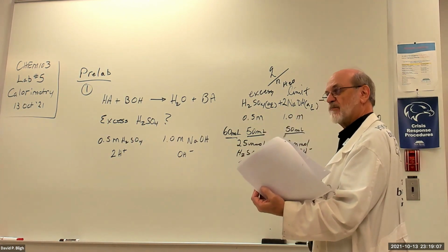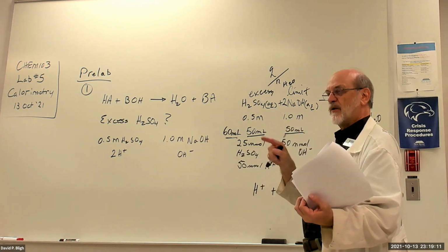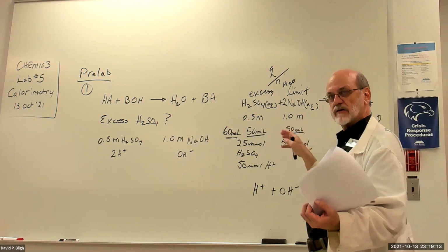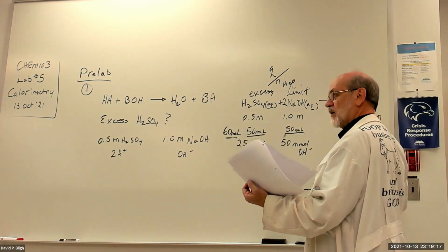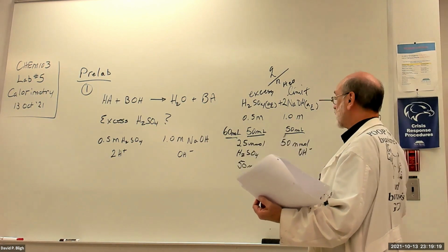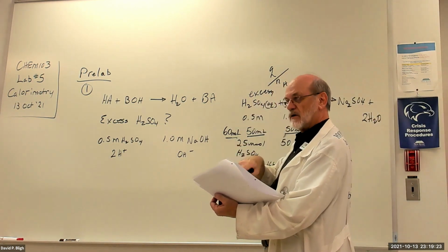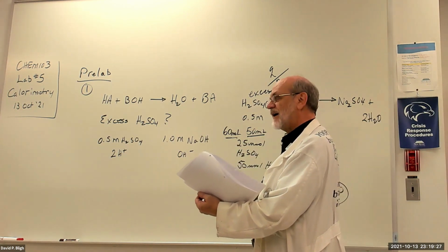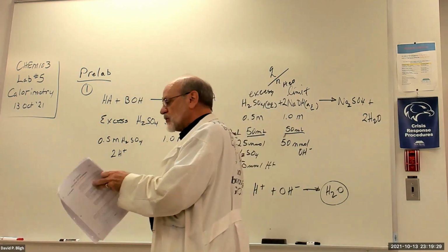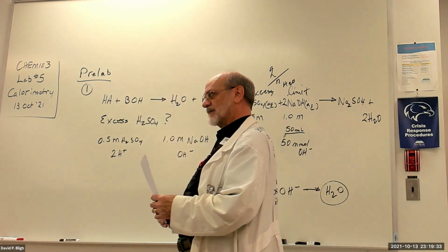Okay, that's what you compare your value to for the first experiment, acid-base reaction. And that is kilojoules per mole of water. So if your answer comes out in joules, in order to compare it with this one, you need to convert it to kilojoules. So the answer is like, to account for error. To guarantee a complete reaction.